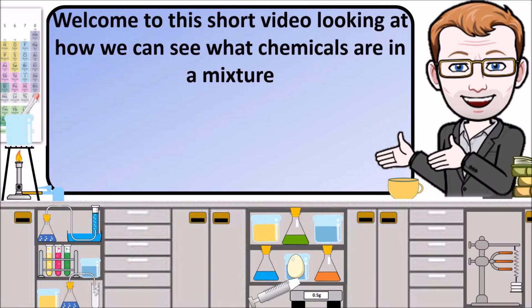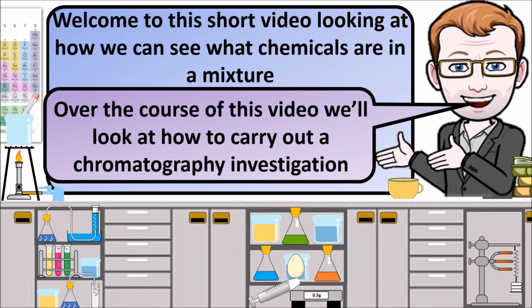Welcome to this short video looking at how we can see what chemicals are in a mixture. So of course this video will look at how we can use chromatography to work this out.